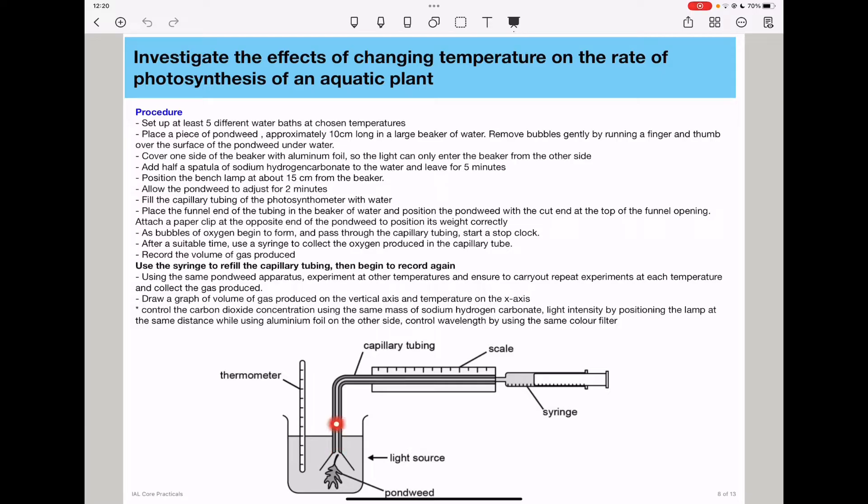The capillary tube is filled with water, and on the other side we have a syringe that is going to collect the volume of gas produced. We have positioned the light source on this side, and you will put aluminum foil covering the beaker on this side to prevent light from coming into this direction. That ensures that the plant is exposed to a controlled amount of sunlight.